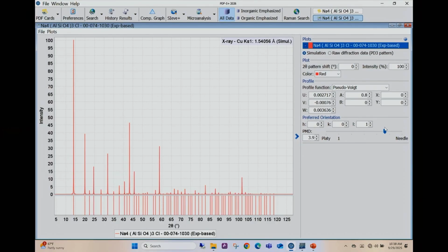So we've heard some comments today that one of the problems for powder XRD is preferred orientation, and sometimes that can make it difficult identifying materials. This just gives you an idea of what's going on, and if you say, well, I've identified what I believe is a phase, but my intensities don't look right, this is a quick idea before you go in to do some kind of profile fitting.